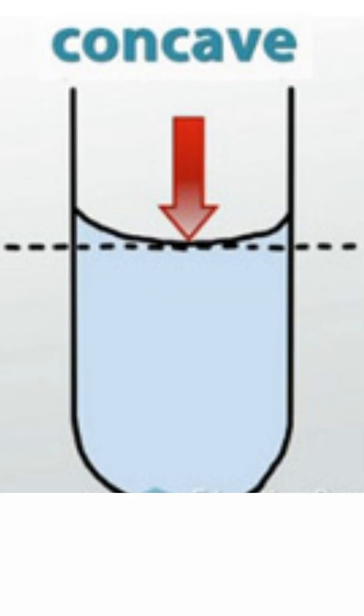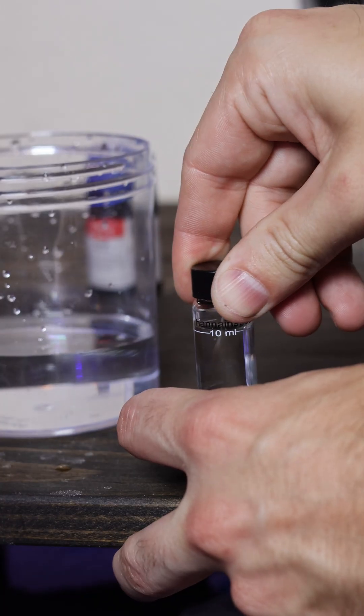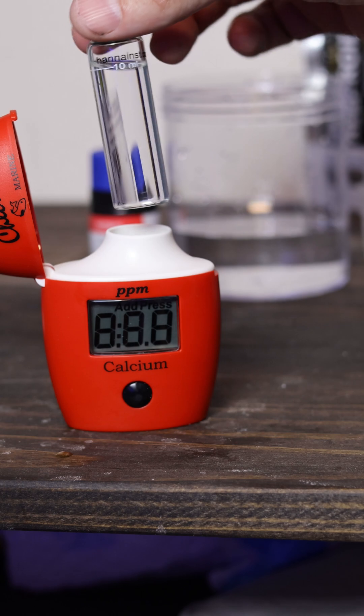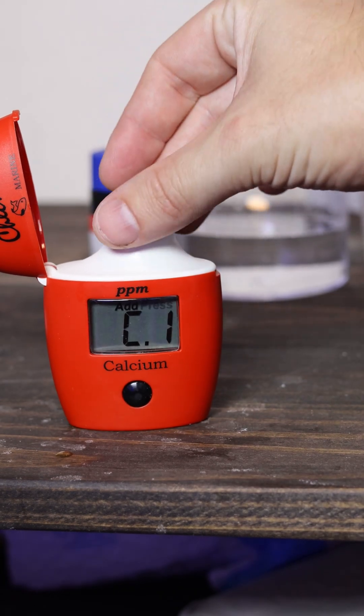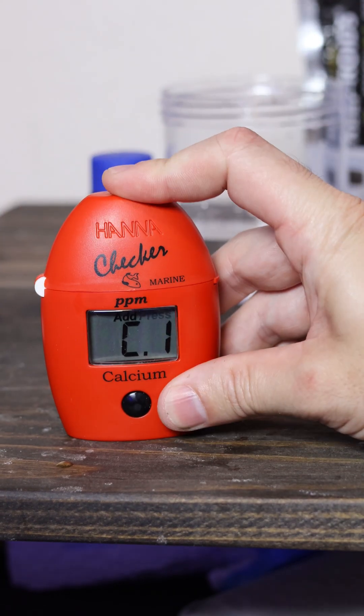This is how it should look inside of the test tube. Insert the cap and give it a shake and then make sure that you clean the test tube. Make sure the Hanna checker says C1, insert the test tube and then press the button.